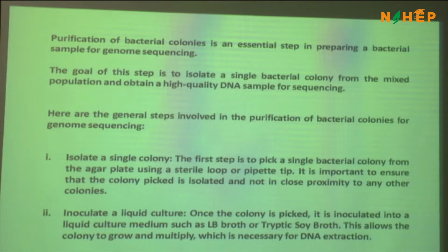Then the next work, once you have microbiologically purified and genetically purified by using DNA fingerprinting technique, the next step comes: you have to mass multiply it. And again, the question is, in the mass multiplication step, what are all the checks so that other contaminants are not appearing there?